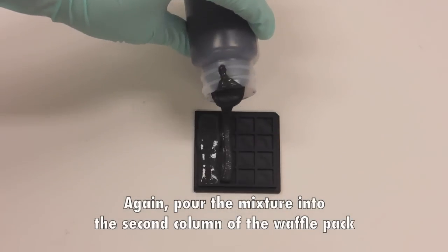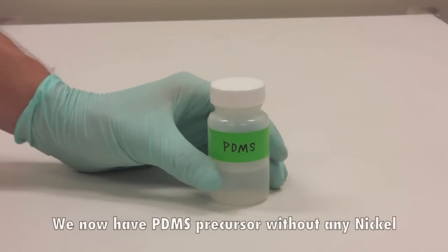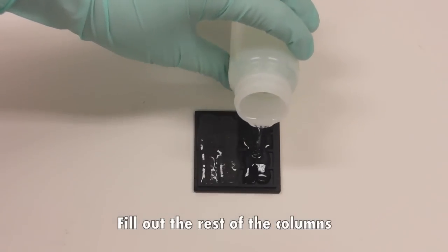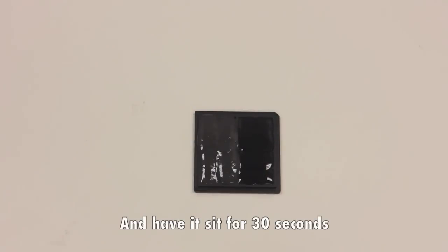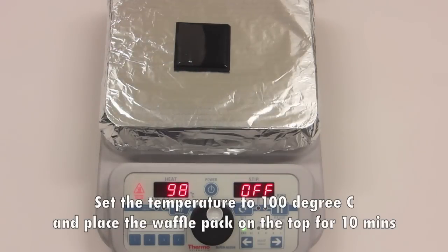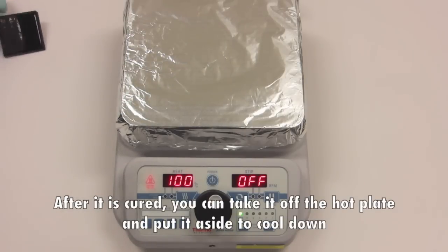We now have PDMS precursor without any nickel — fill out the rest of the columns and let it set for 30 seconds. Now we are ready to put it on the hot plate. Set the temperature to 100 degrees C and place the waffle pack on the top for 10 minutes. After it is cured, take it off the hot plate and put it aside to cool down.